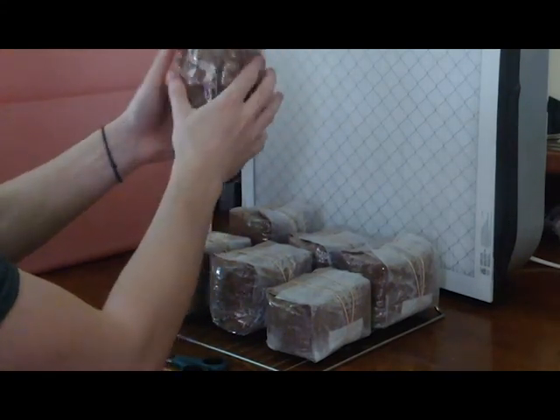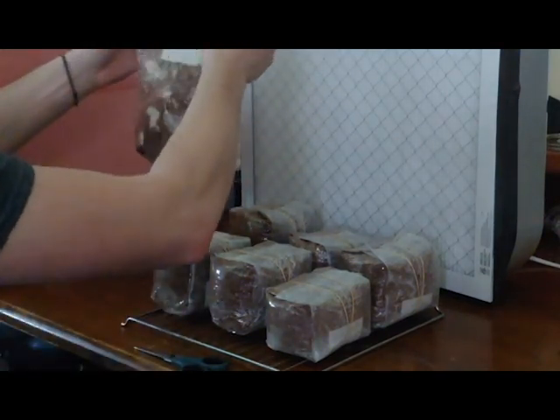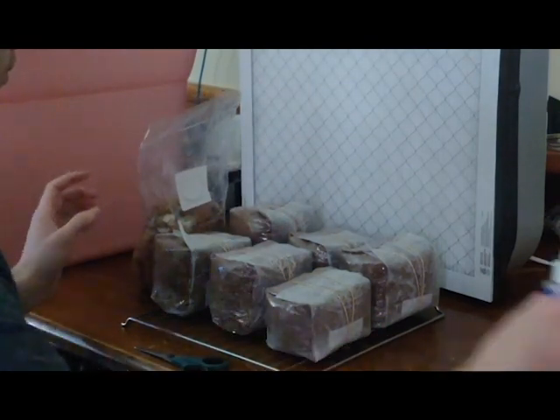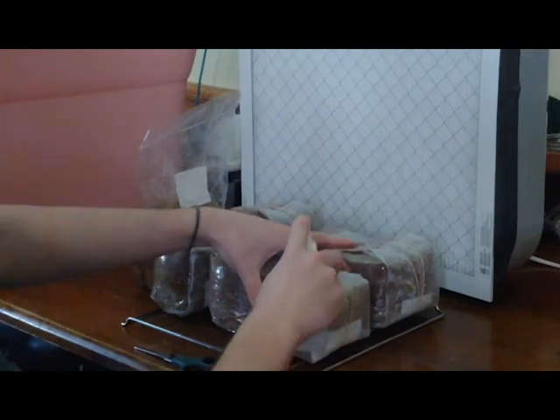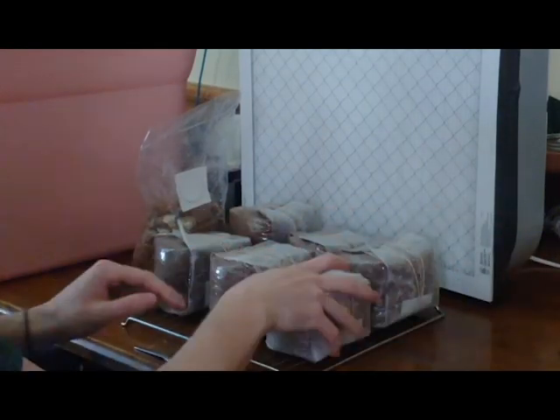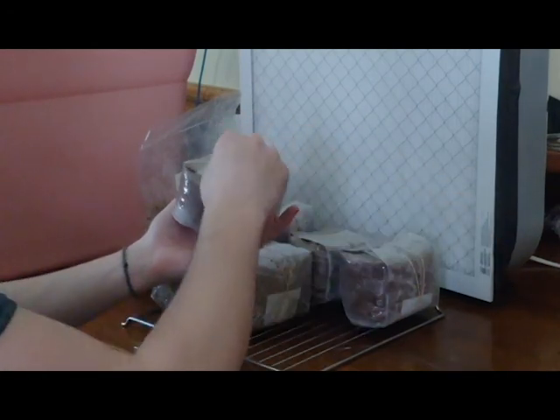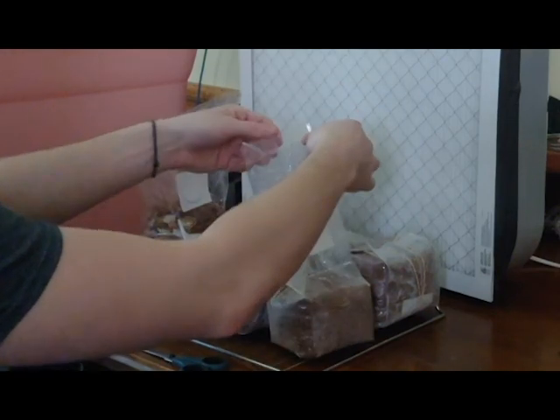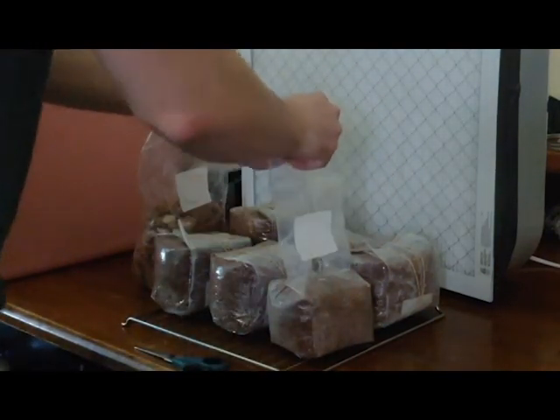Some of those petri dishes — there are so many issues that could have occurred, so many things going on in the world that you can't control. The laminar flow hood is just there to give you some extra control. You just have to make sure you're doing proper sterilization practices, and from what I've seen, this box fan is perfect for poor man's mycology work.